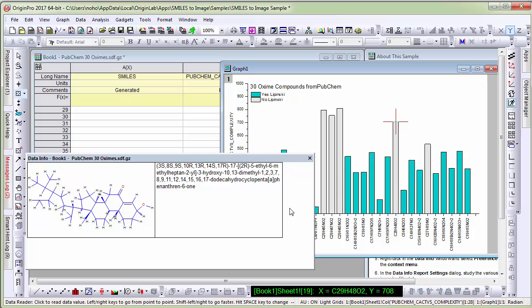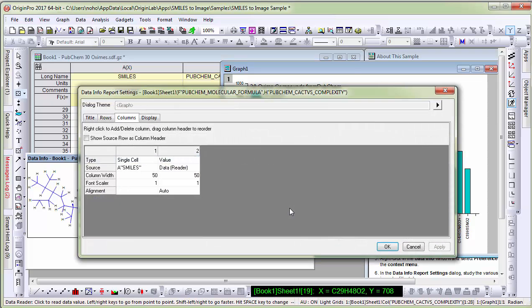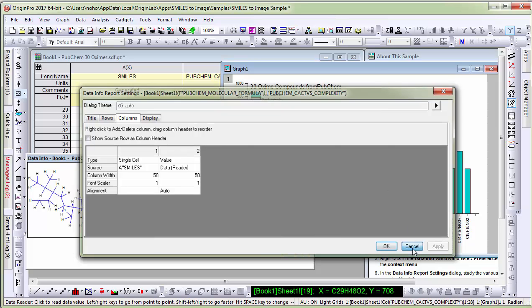To customize data info, you can simply double click and follow the help file available for customization.